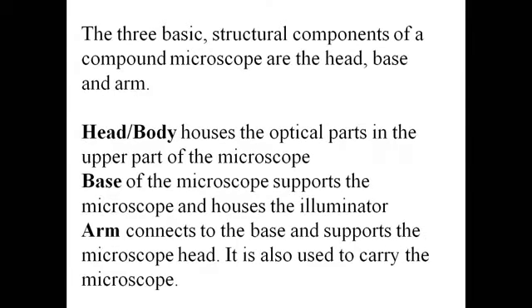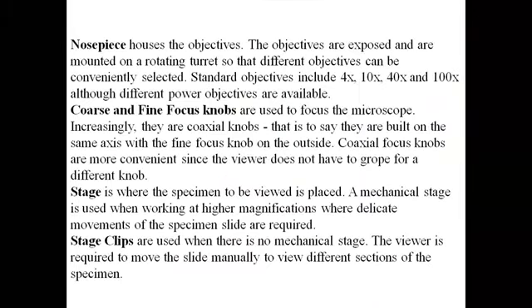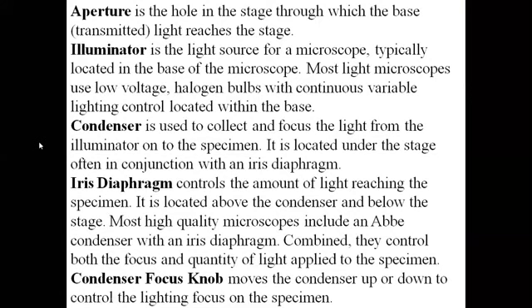Then there is one more thing, like this illuminator, whatever amount of light it is giving, that amount of light can also be controlled. Okay. So that is what it is saying.